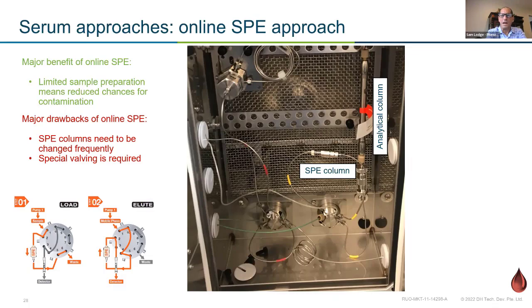So we've designed a couple different ways of doing this. There is an automated version where you can actually do it online. As you can see in the schematic here, this is a great way of doing it from a productivity standpoint. The only problems are that it requires a significant retubing. You have to use a very complex system of valves and software to arrange the flow paths.